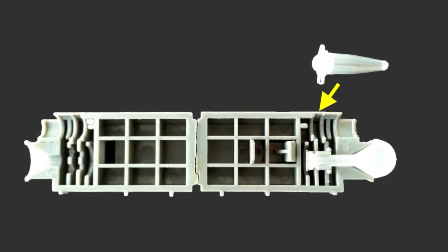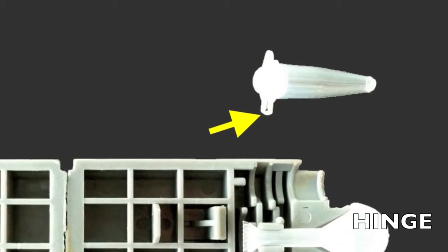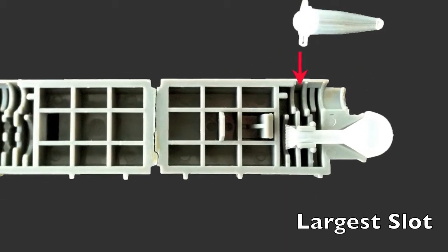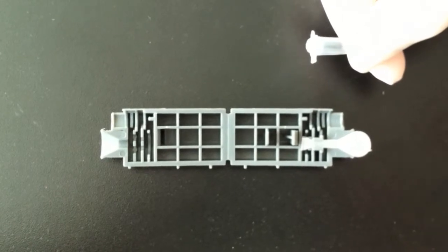Place the reaction tube into the amplicon cartridge. Be sure to place the hinge of the tube cap into the largest slot adjacent to the buffer bulb. Let's see that in live action.